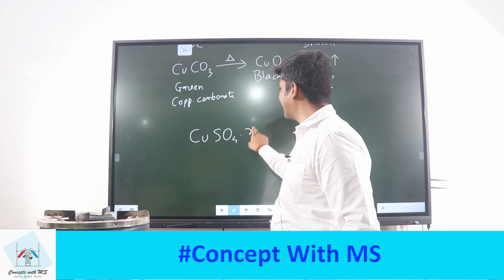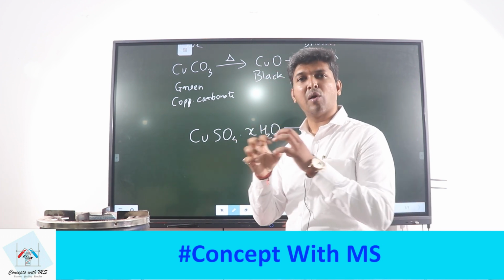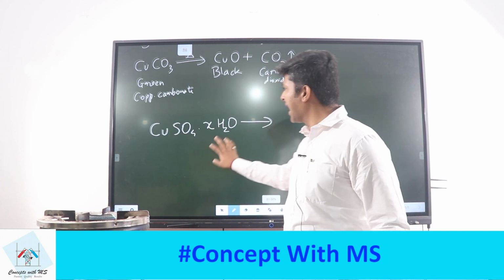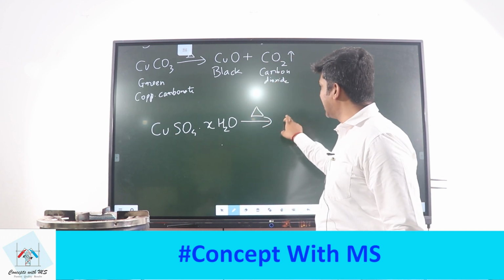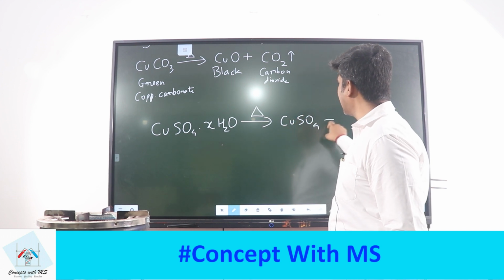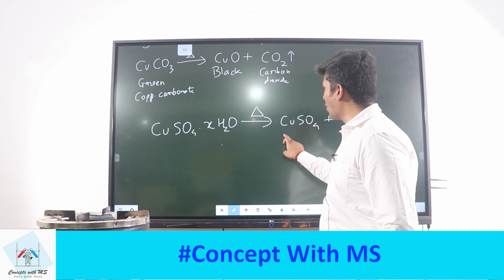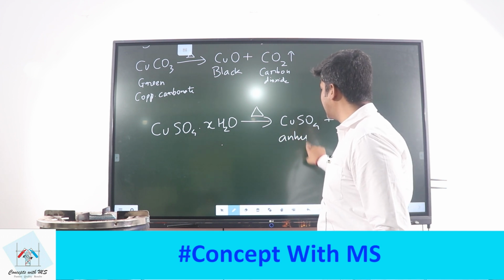Hydrated meant it had some molecules of water in it. Inside the crystal, some water molecules were there. And when you heated this, it got converted into anhydrous copper sulphate. Water got evaporated and you got anhydrous. Anhydrous means completely without water.